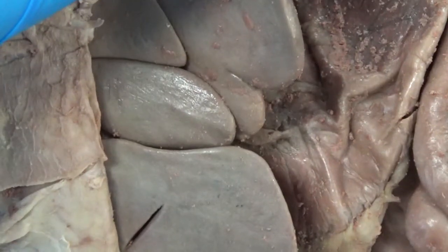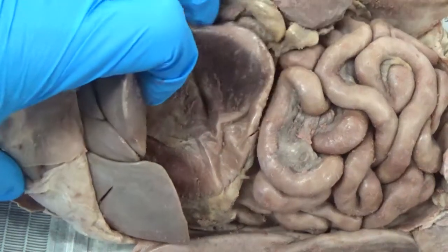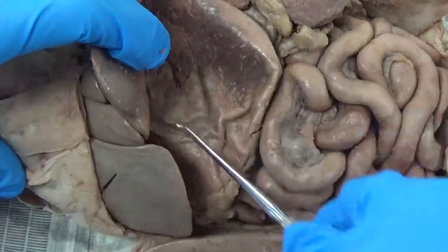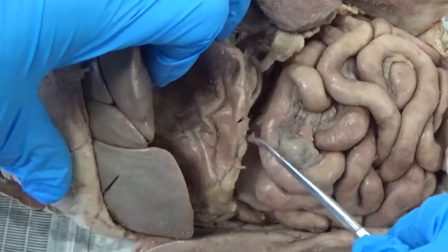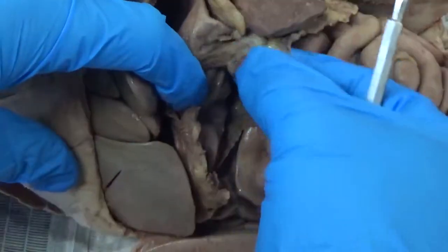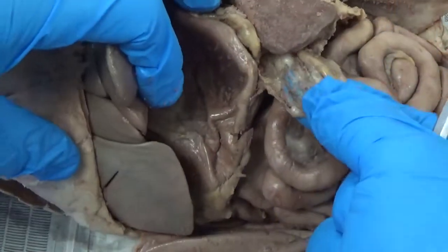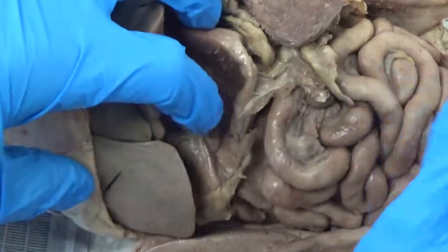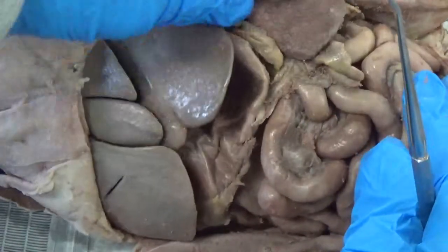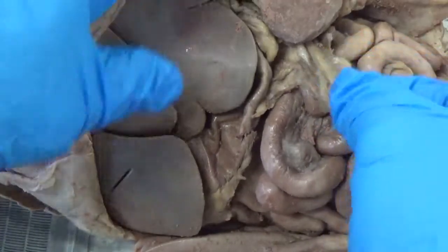If we zoom back out a little bit again, here we can see the stomach, and the stomach is pretty distended. I accidentally cut into it a little bit, but we'll open it up later and see what's on the inside. The remains right here of what you see here are the remains of the greater omentum. I don't know if you remember that, but it was an apron-like covering of the small intestine. It functions in, well, protection. It also stores fat, and it also helps with immunity.